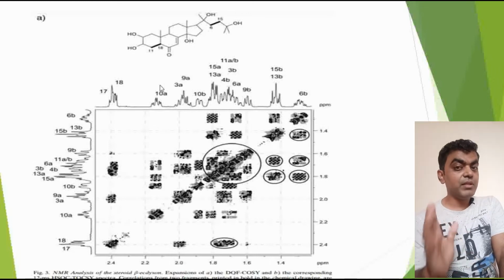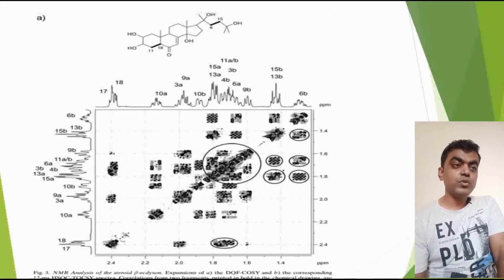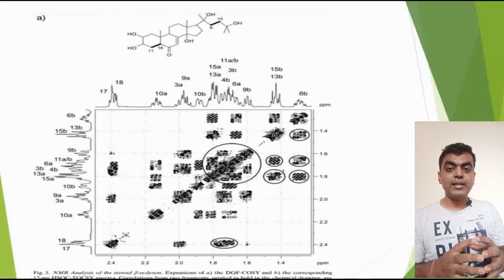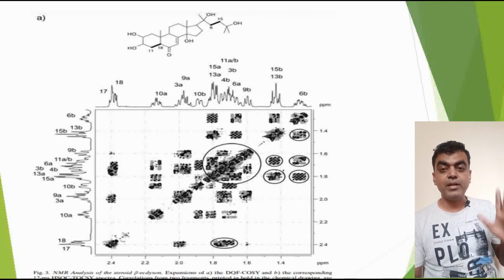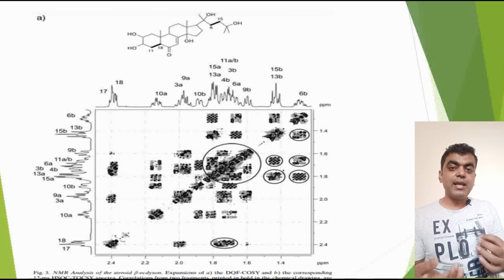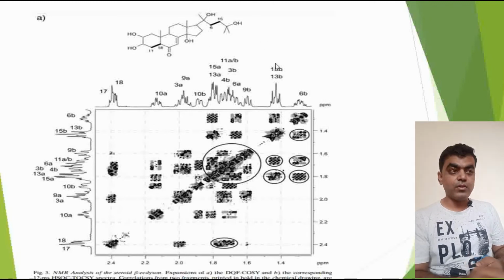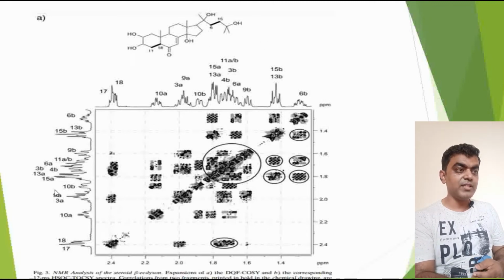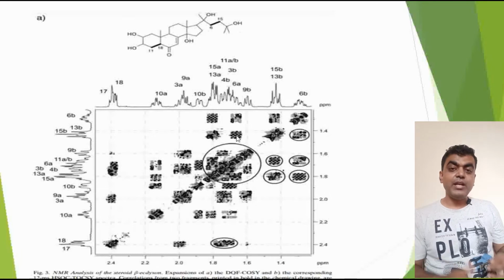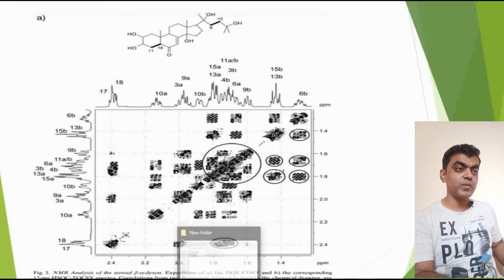Okay, this is something you need to understand really well, because the common practice is that we used to take a printout of the 2D spectra, take a pencil and scale bar, and draw lines. You make a grid, drawing lines from these peaks and from those peaks, and you see at the junctions whether they match with the cross peaks or not.